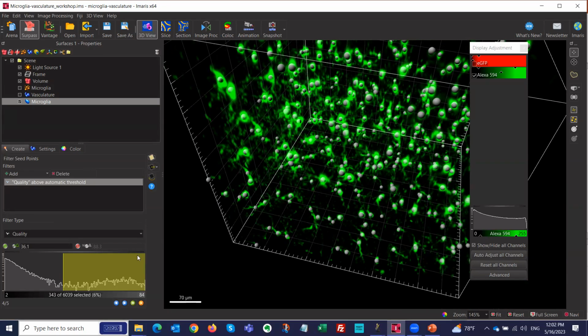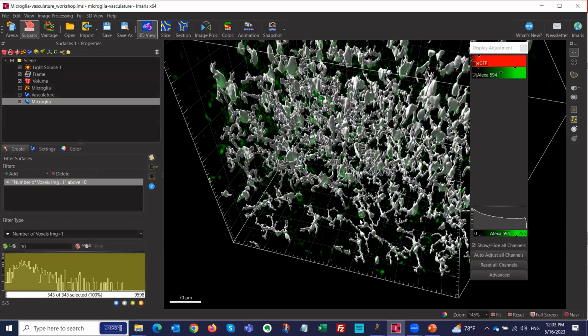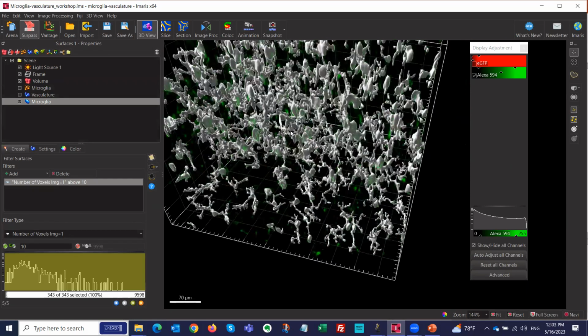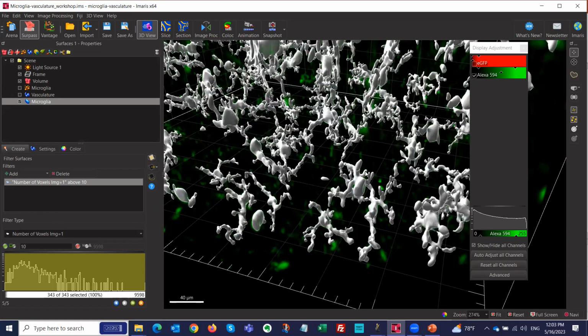So basically, I'm using the spots that we've done before already here to create only surfaces of those spots. Like it's an AND function. Only where there's a surface segmentation and a spot was inside there, we are resulting with a microglia surface. Okay, like this one is not there, this one is not there, this one is just this. So there's no need for a filtering step because the spots essentially replaced our filtering step, meaning we have 343 microglial surfaces.